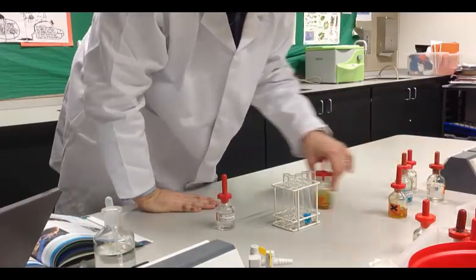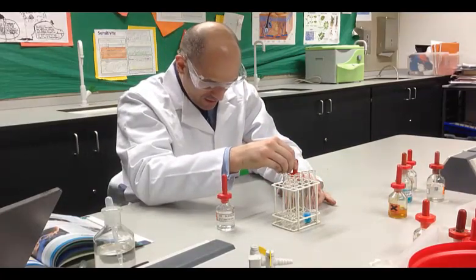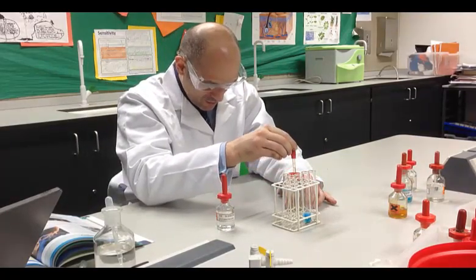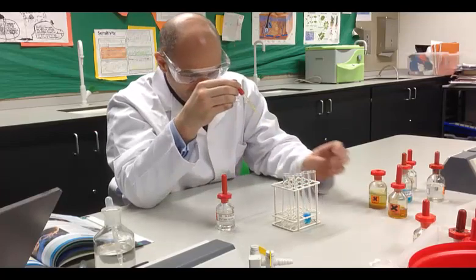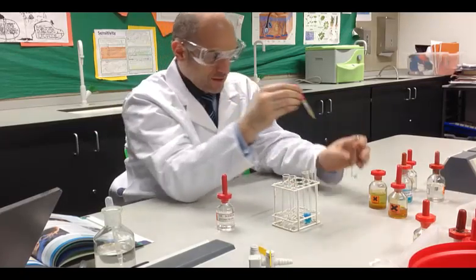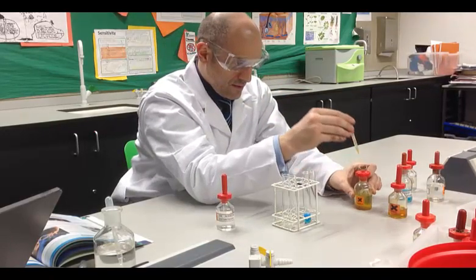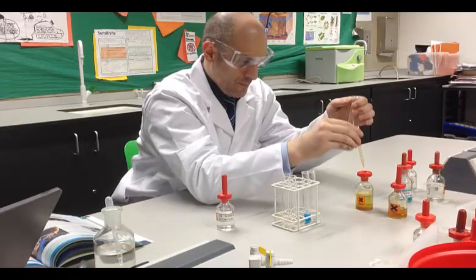Here I have some iron 2. Now iron 2 is actually a blue-green solution. This doesn't look so blue-green because it's gone off a little. Okay, there we go.